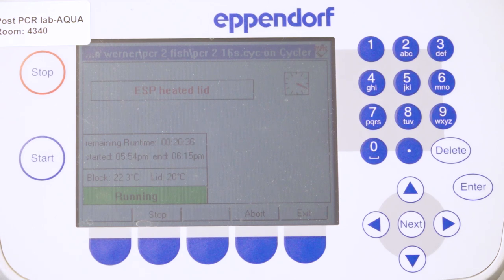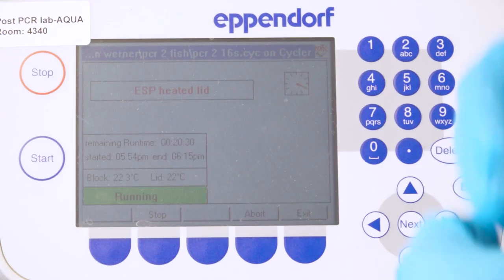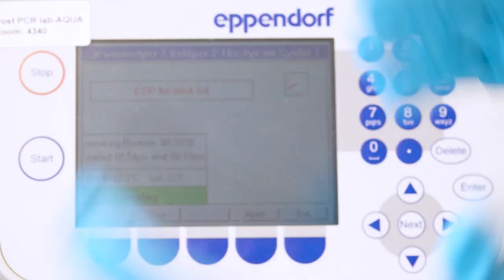Then it starts running. Since it's only 12 cycles, this only lasts for 20 minutes. While it's running, you can start to prepare the gel for looking at the products from the second PCR, or you can do the calculations for the cleaning procedure if you prefer that. It's always smart to do something in between because then the whole process is way more streamlined.